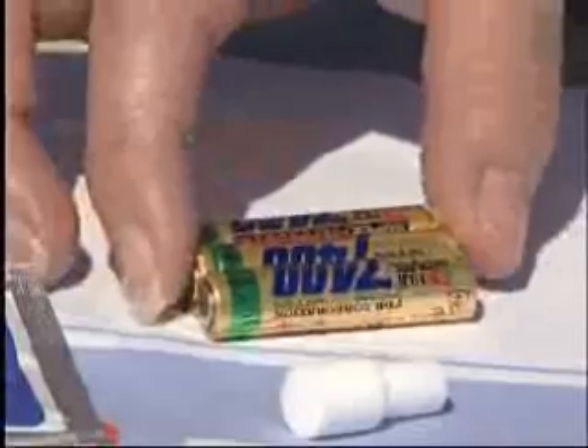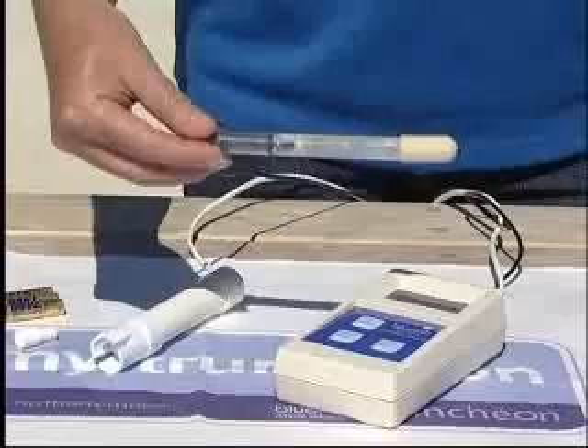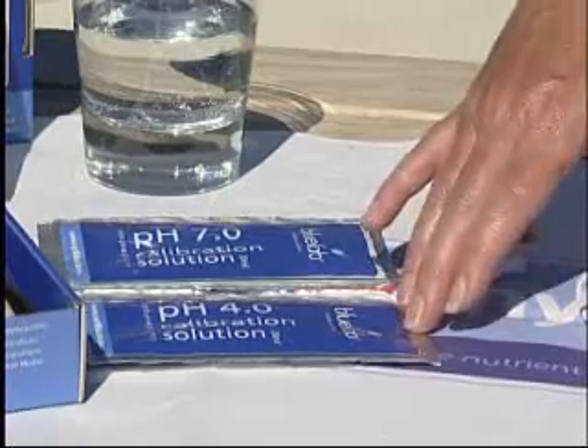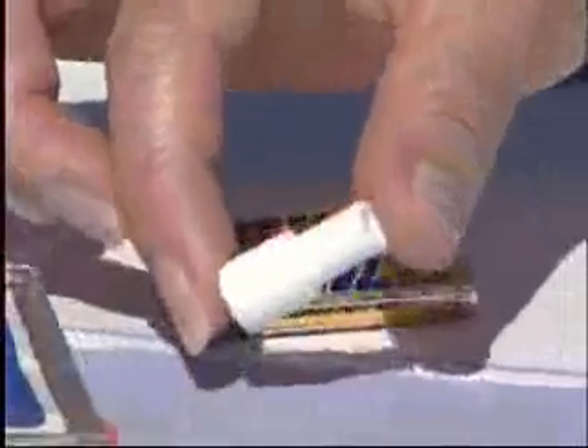The combometer is powered by 3 AAA batteries which last 12 to 18 months. The Bluelab combometer comes with a conductivity and temperature probe, a pH probe, batteries, two single use calibration solution sachets and the Bluelab pH probe cleaning tool.